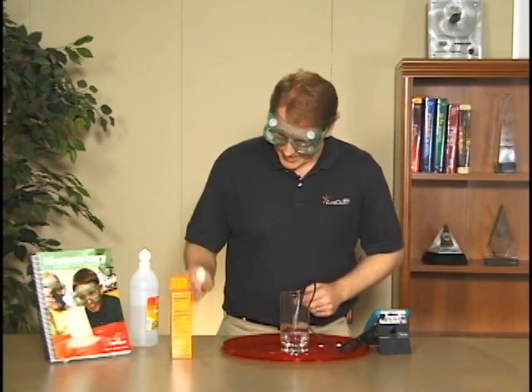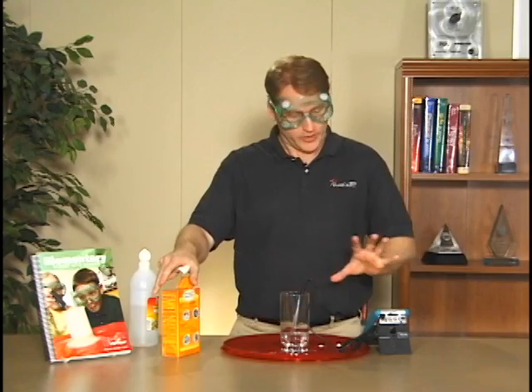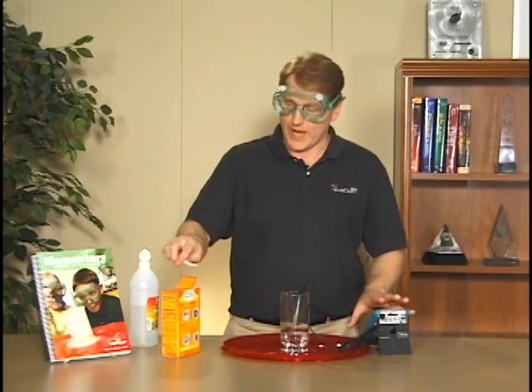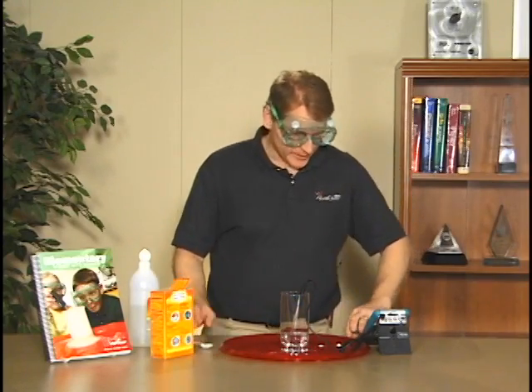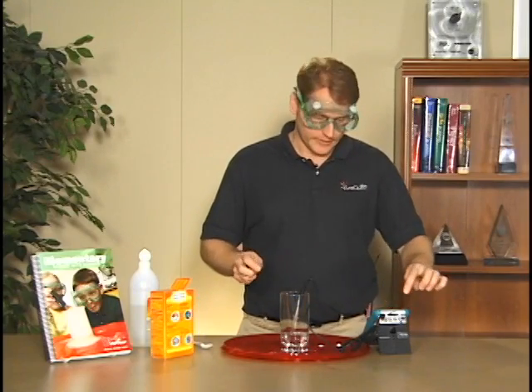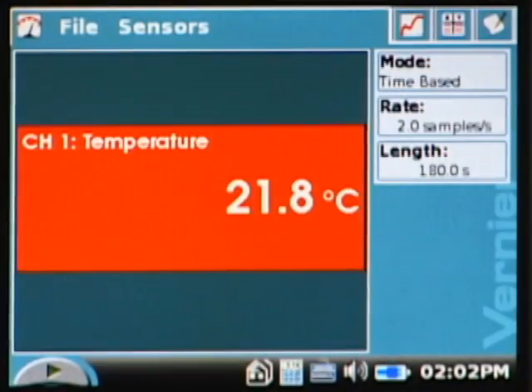What I'm going to do is start the data collection first before we add the baking soda. When you plug in the temperature sensor to the LabQuest, it auto IDs the sensor and right now it defaults to being 180 seconds for our time and two samples per second.